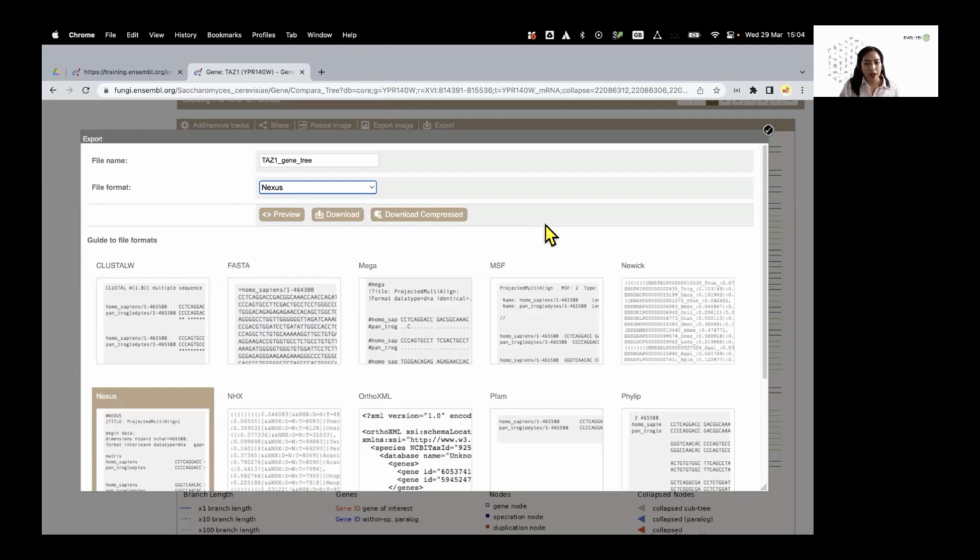So someone's just asked, how do you convert phylogenetic trees to a pie chart? There are different ways to do this. There are programs where you just give it an alignment file and then it generates a tree for you, or you can do it yourself in R. So in RStudio, you can write code that also allows you to change the different colors. So you can have your own color system and generate a tree that way, but it is much more complicated. I can give you some websites where you can just upload a file and then it will generate a tree for you if you like.